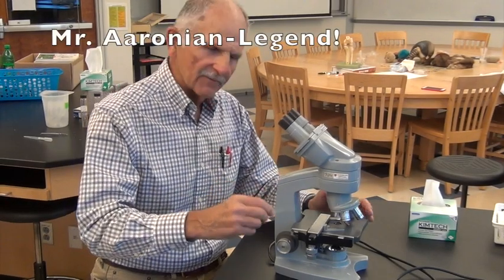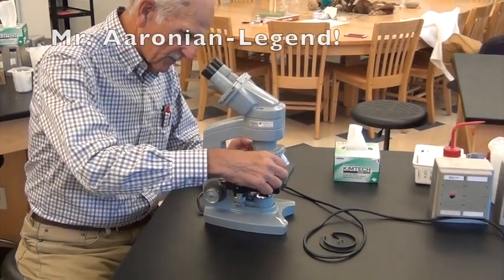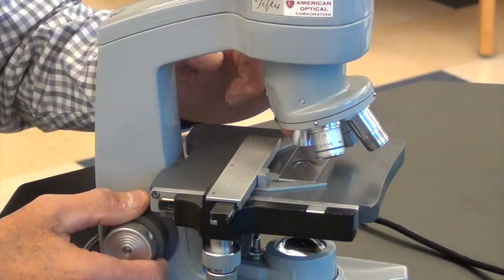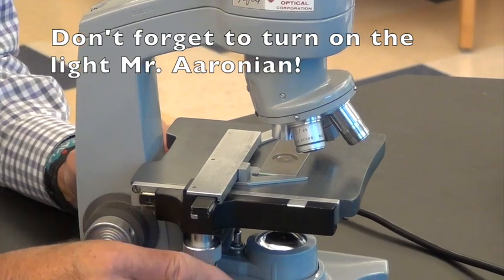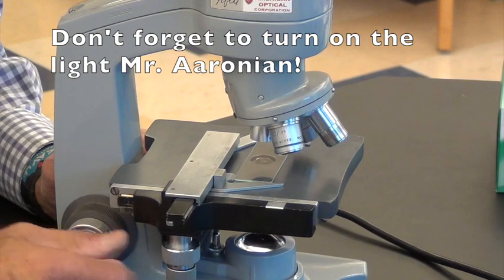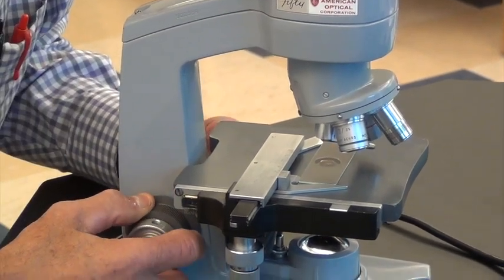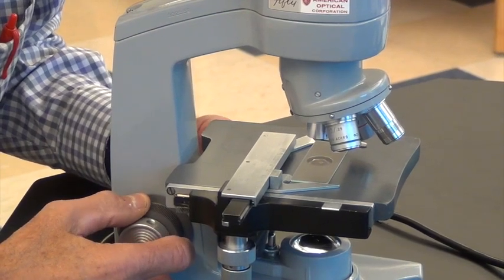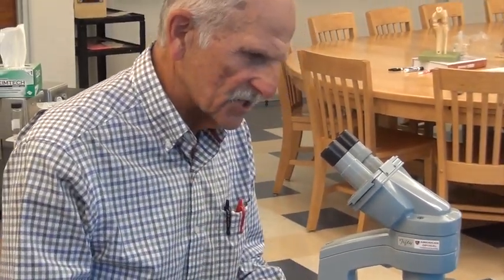I've prepared my slide and I'm going to put it on the stage. I'm going to move the stage clip and put my slide on there. Make sure I'm on the lowest power objective and all the way down. I want to have what I'm looking at right over the light source so I can look in — maybe blurry. I'm just going to focus up until something comes into view. Now I've got it right where I want it under low power — that's where I'm going to stop.